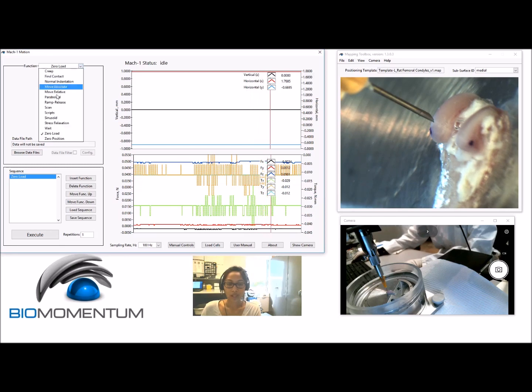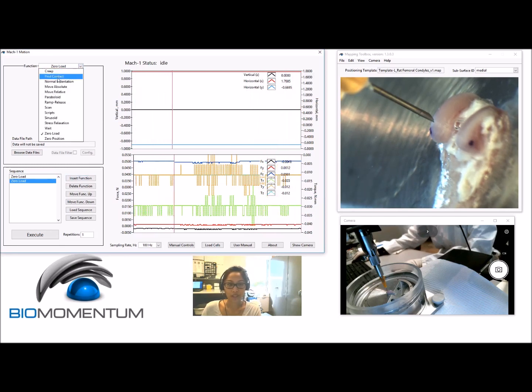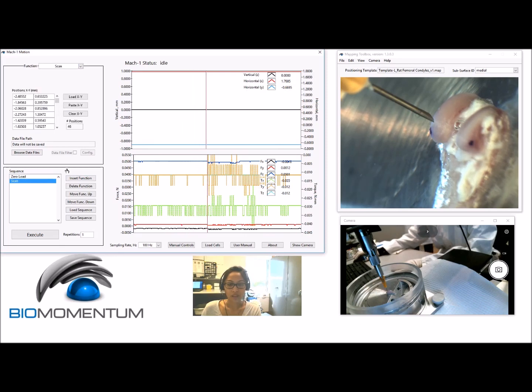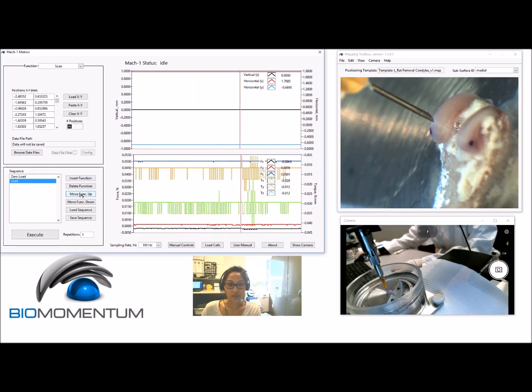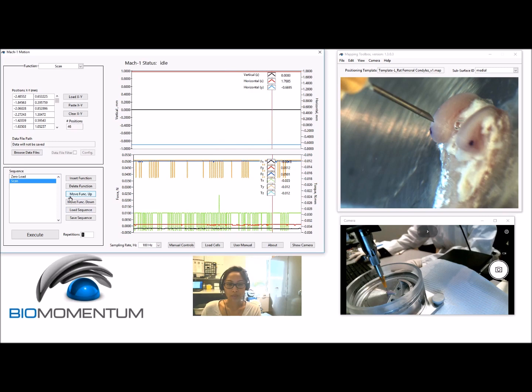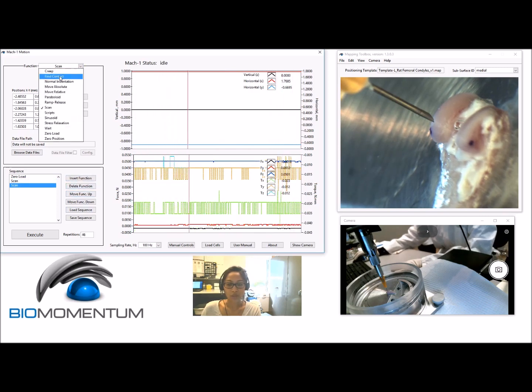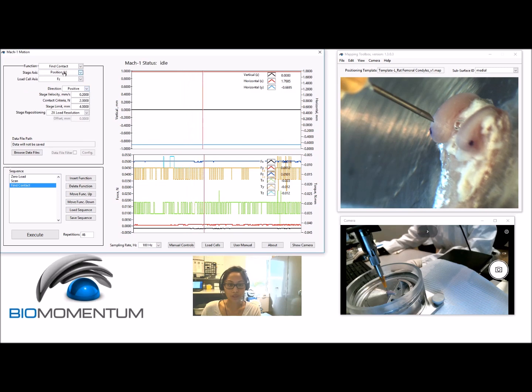Create the following sequence for the automated thickness mapping: add a zero load, followed by a scan function with the same copied position coordinates. Ensure that the number of repetitions is equal to the number of positions.